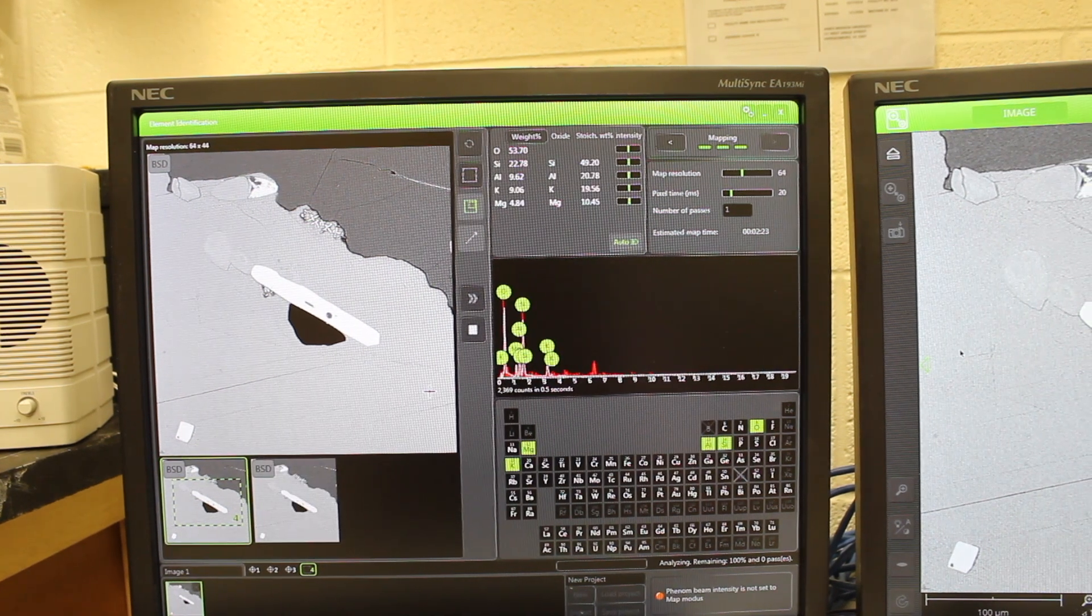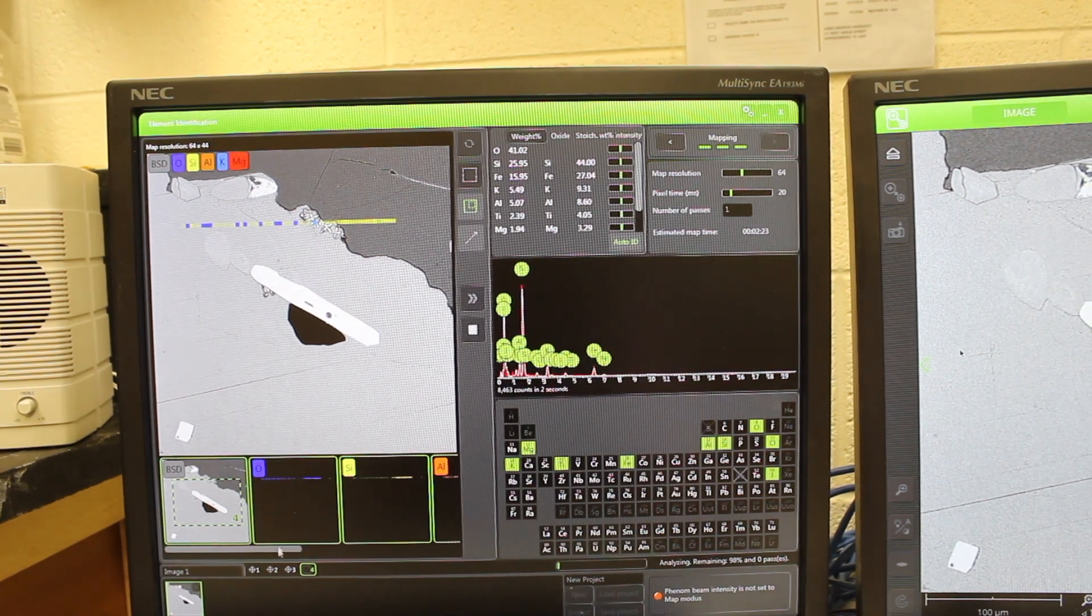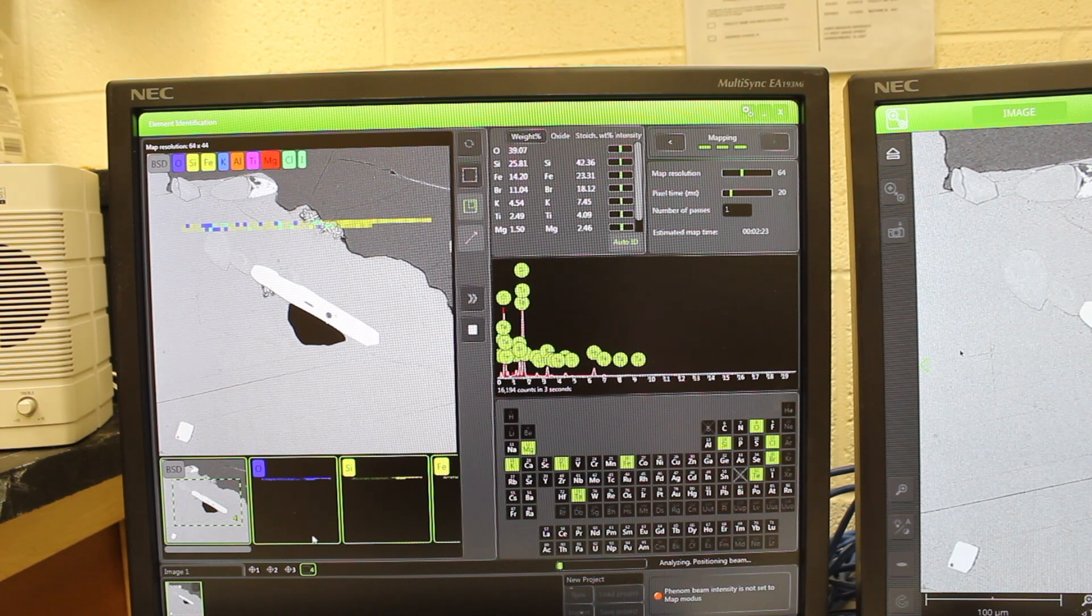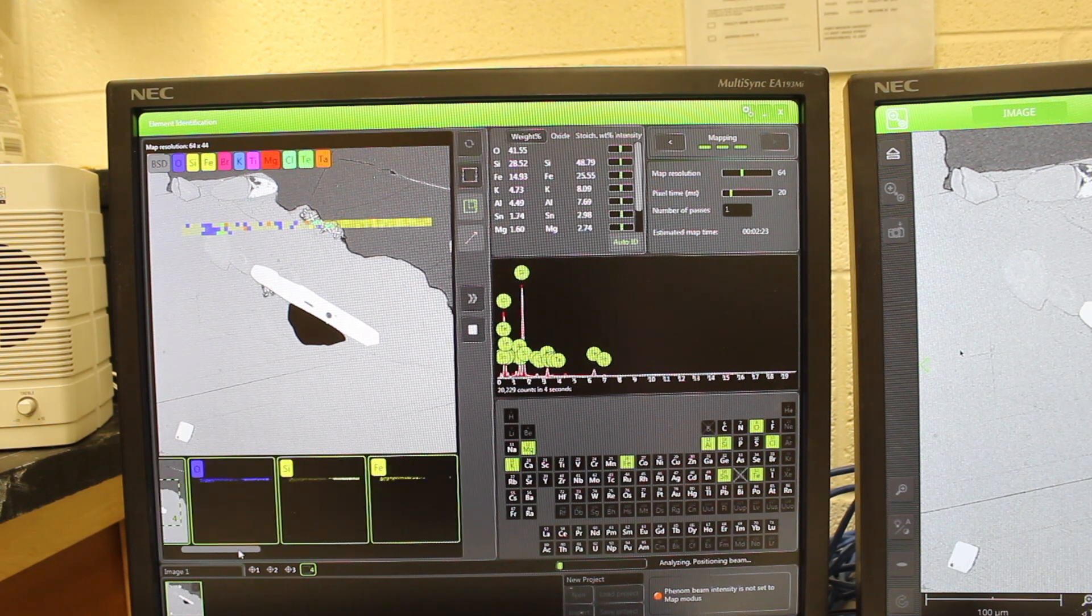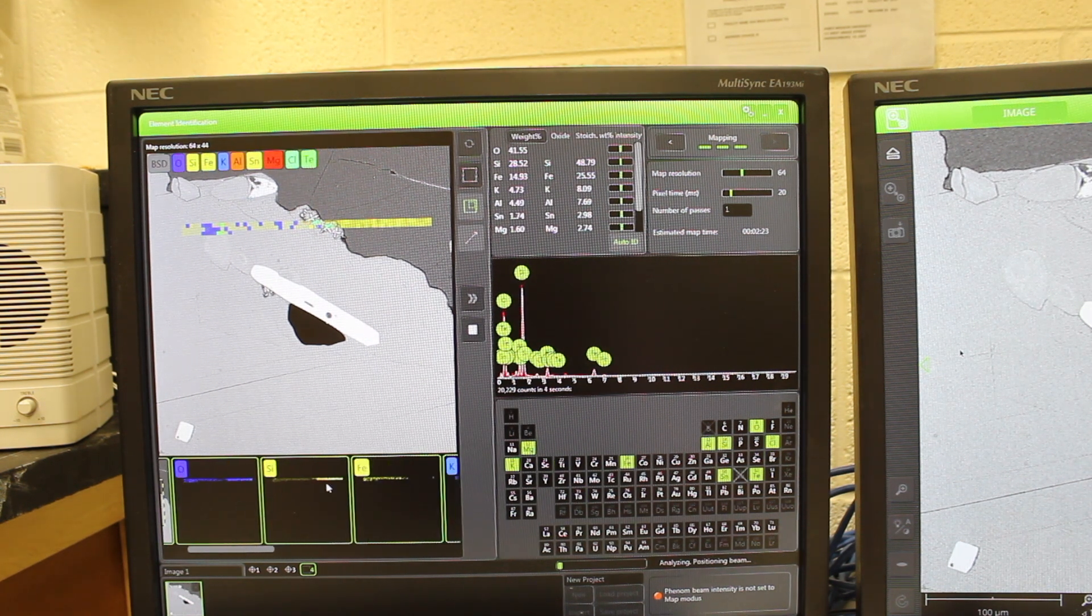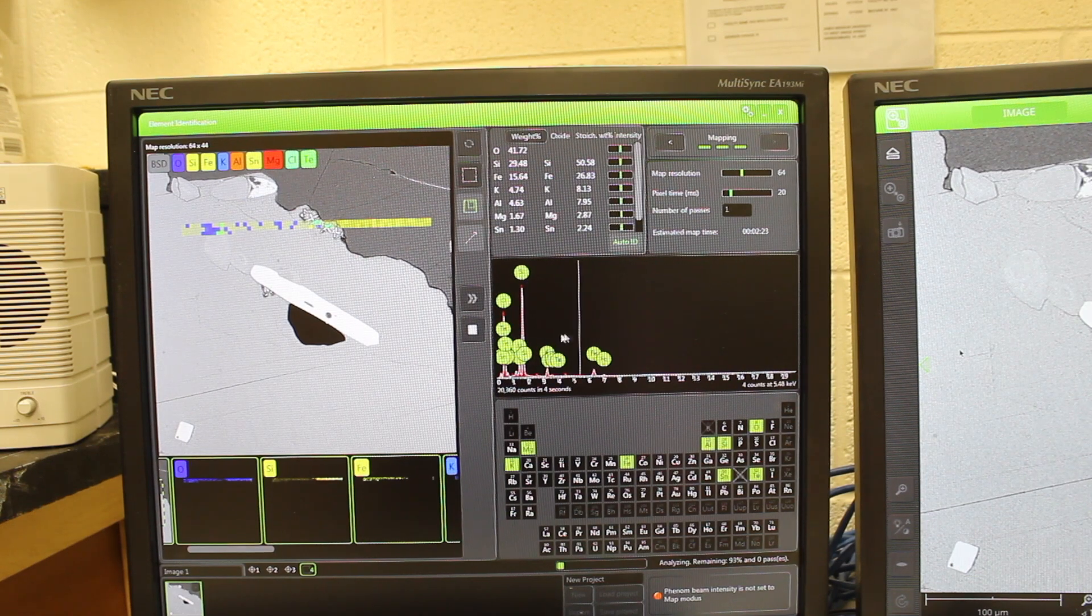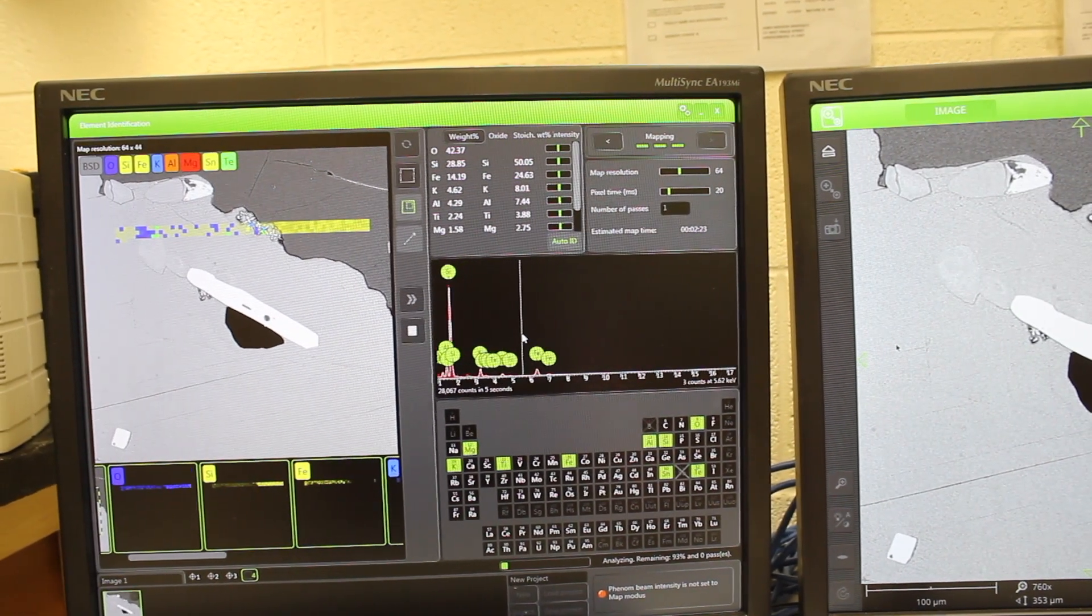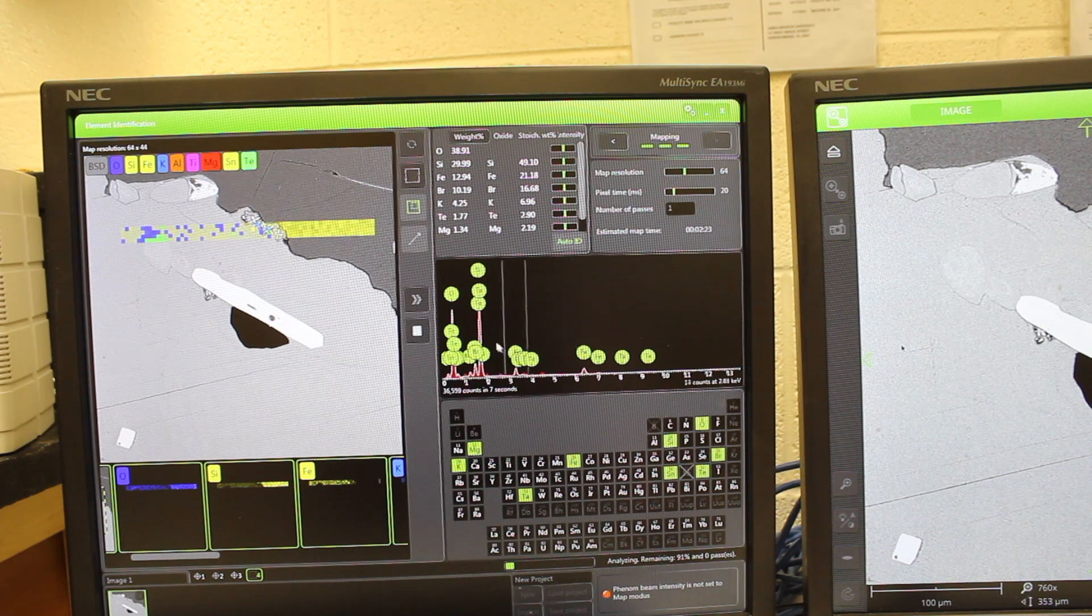The software will bring up these images down at the bottom here as it's analyzing for different elements, and it also has the EDS spectrum here, which you can zoom in again.